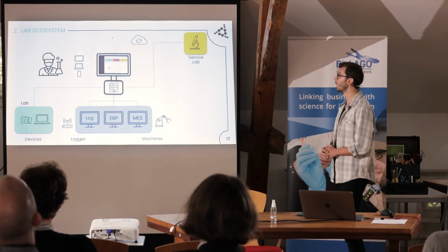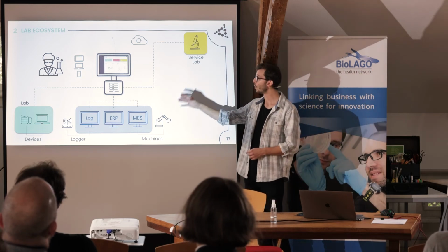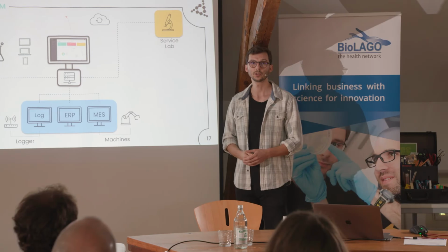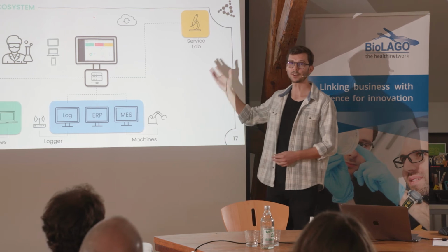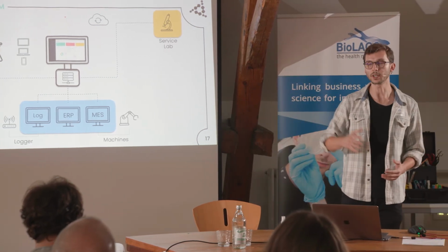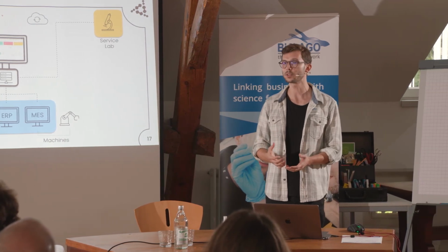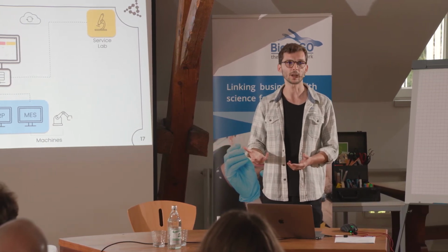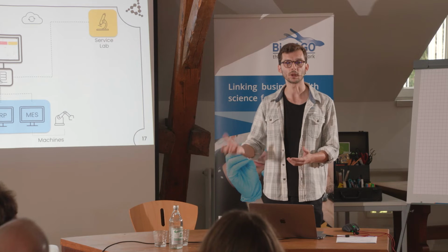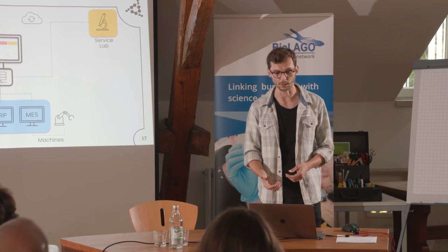Also, not all laboratories or quality control laboratories in the industry do all their analysis by themselves. So it's also important to have an external analysis or external connectivity to a service lab, to which you can send some orders with predefined QR codes and labels. The service lab gets these samples, can scan them, analyze them, and send just the reports or the analyzed values back into the LIMS system of the company.